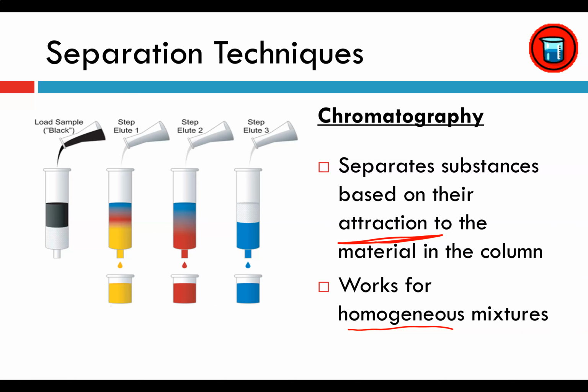If you imagine that same scenario, except I've filled the hallway with complete strangers. Yeah, I mean, you're not going to be able to just sprint right through them, but you are probably not going to stop and talk. You're going to get through that hallway much, much faster because you are not attracted or interested in what's packing the hallway, or packing the column. The same thing applies here.